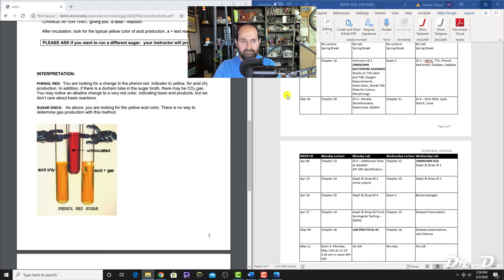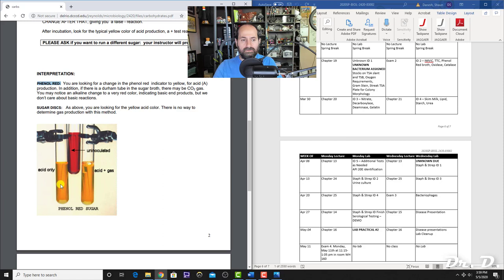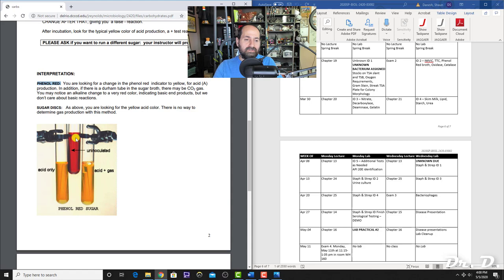Phenol red is the color indicator—already mixed into the tube, not a reagent you add. It's red when neutral and turns yellow when acidic. If the bacteria can use the sugar mixed in, they reduce the environment and cause a pH change to acidic, turning the tube yellow. If it stays red, the bacteria did not use that sugar.